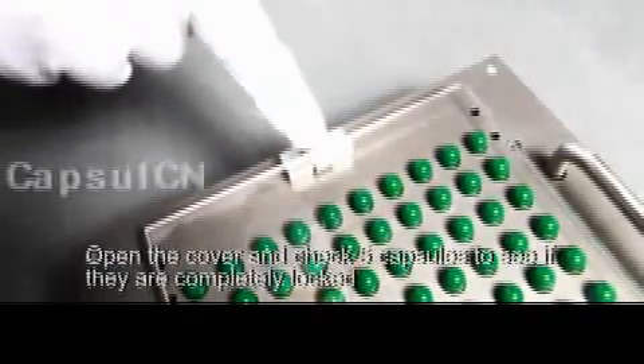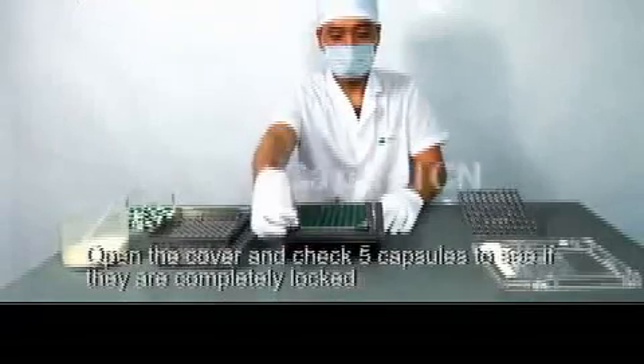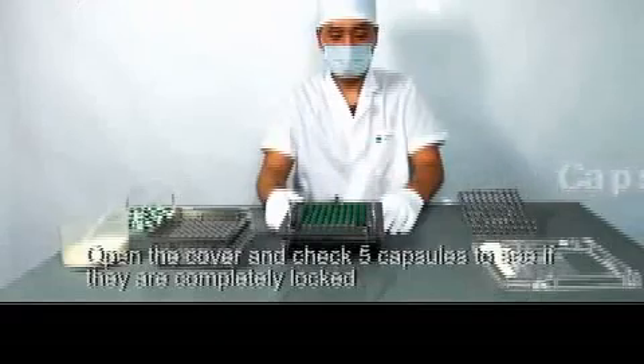Open the cover and check five capsules to see if they are completely locked.